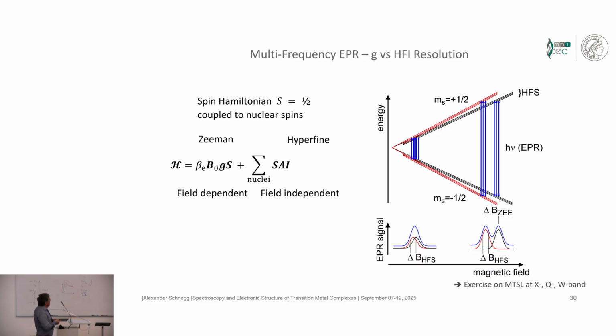And then one possibility to increase the resolution in the spectrum is to increase the external magnetic field. This is shown here schematically for the case of a sample which has two absorption lines with close-lying resonances because of close-lying G values. If we increase the external magnetic field, the resolution increases if we assume that the line width of the sample stays the same.